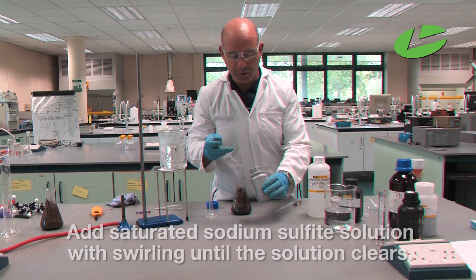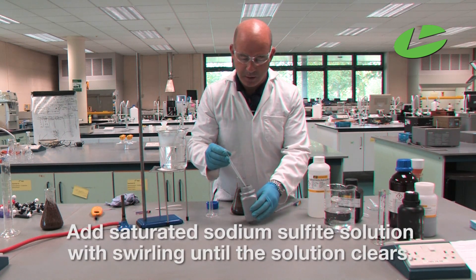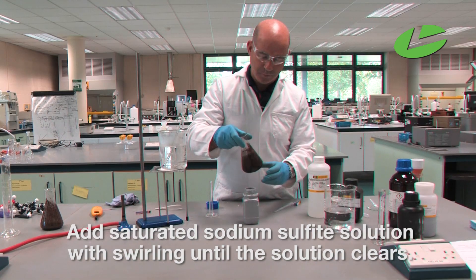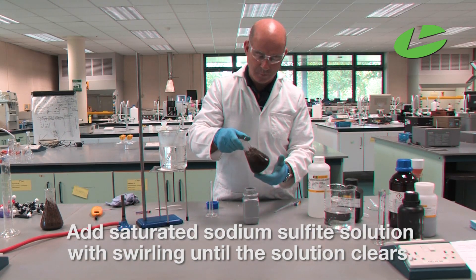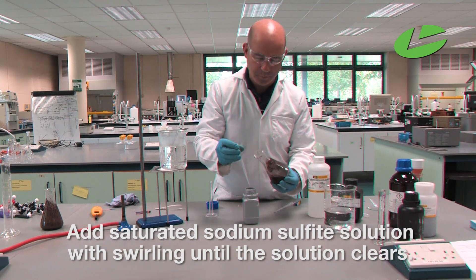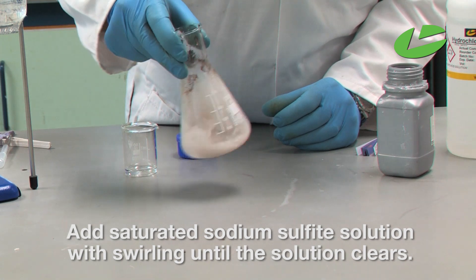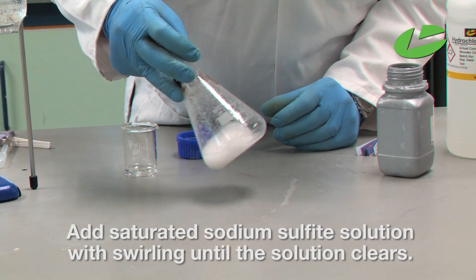Here I have the sodium sulfite solution, and I'm going to add that in dropwise until the brown precipitate disappears. Keep adding, and we'll start to see benzoic acid precipitate.